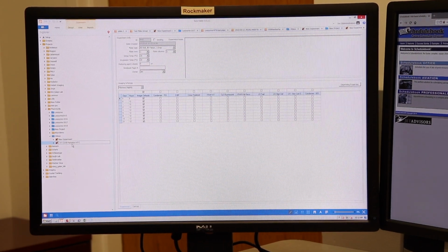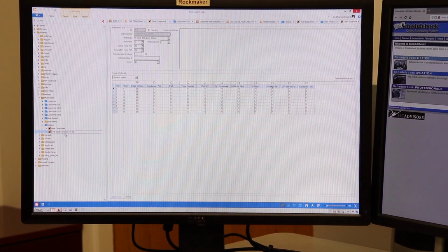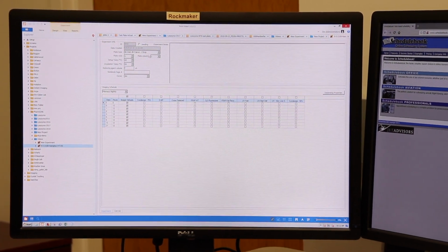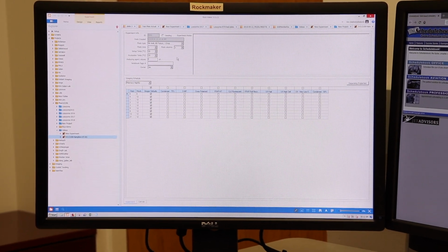And then perhaps your protein, let's just call it R5. Okay. So then in this tab here, this is going to be our experimental setup.